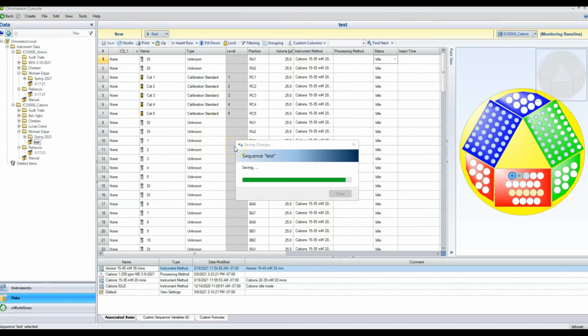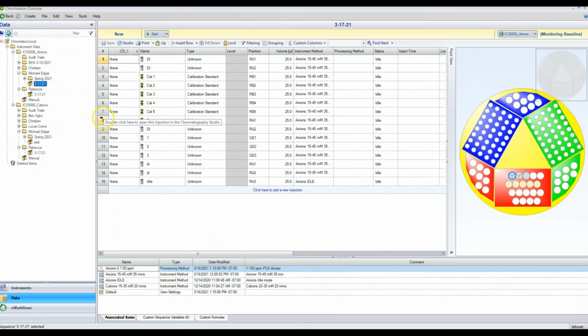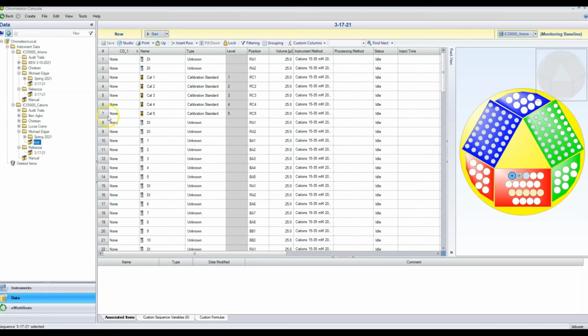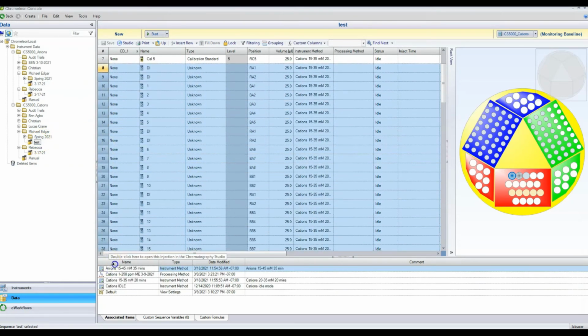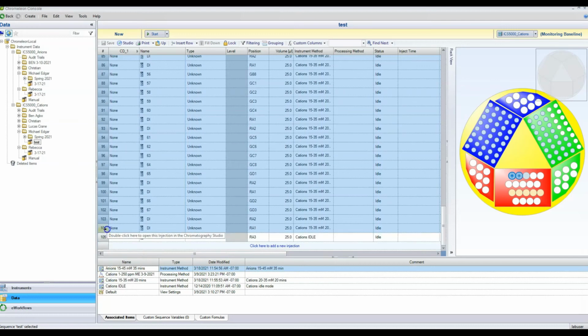Now right here is where we are going to do something that saves us a lot of time, especially if you have a sequence that's really long. At this point, I can go back into my other run, and I can just copy everything except the calibration curve and the idle. So I'm going to copy it. Now I'm going to select everything here except for the calibration curve and the idle, and I'm going to paste over it.